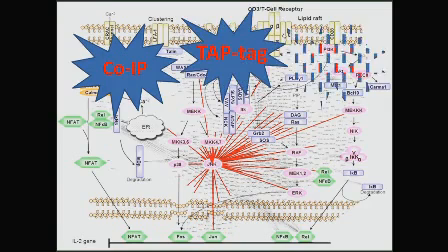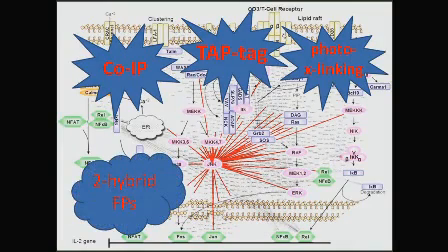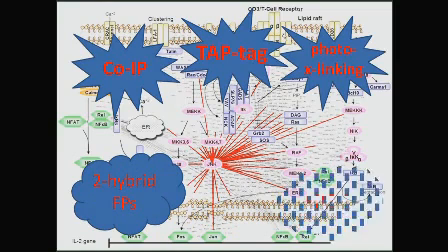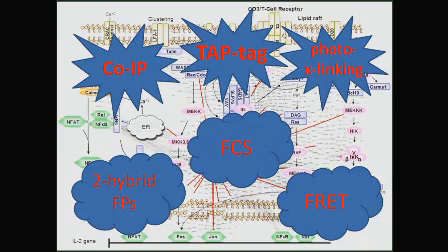Co-IP, TAP tag, or photo cross-linking assays allow for purification of prey molecules in vitro. In addition, several approaches were designed for the analysis of protein interactions in a living cell. These include two hybrid screens or complementation assays of fluorescent proteins. Furthermore, some spectroscopic approaches like FRET or FCS and also non-spectroscopic methods have been established to address this question.